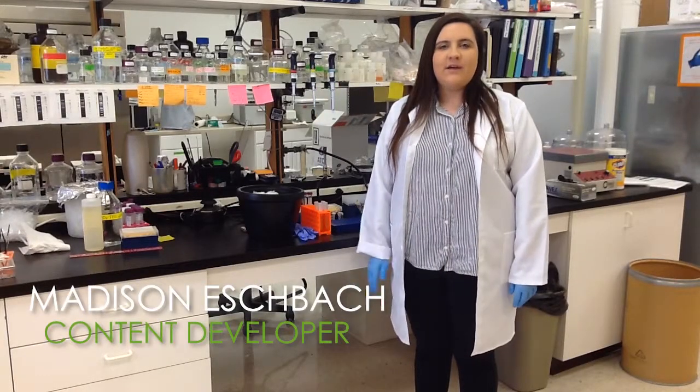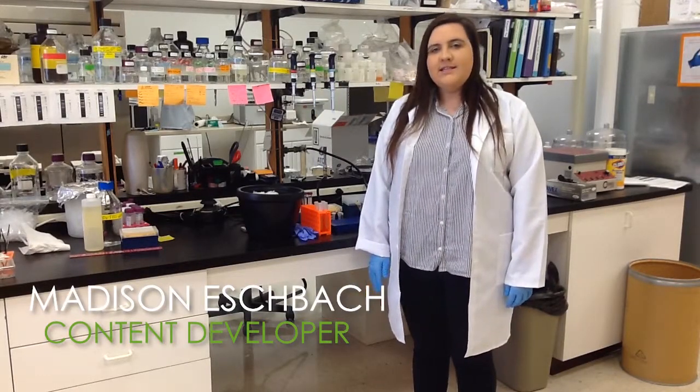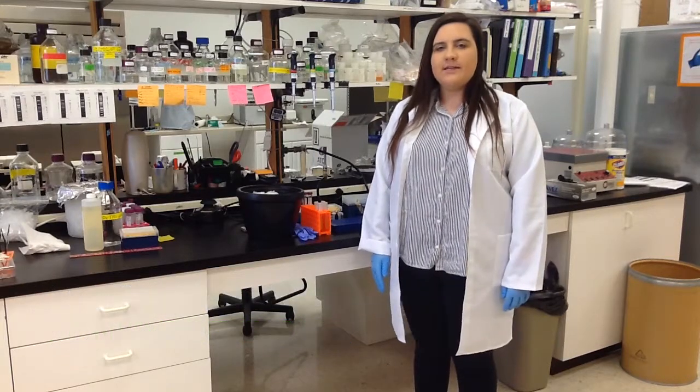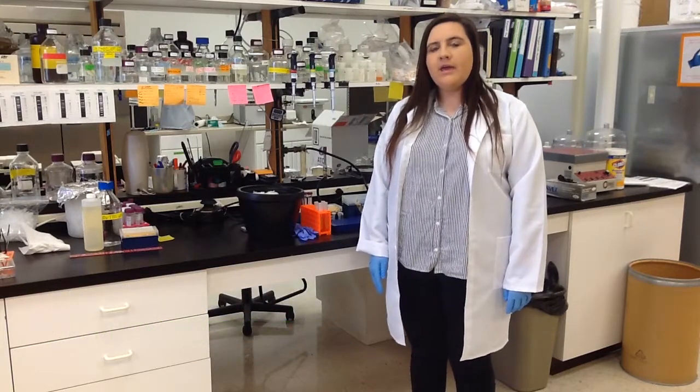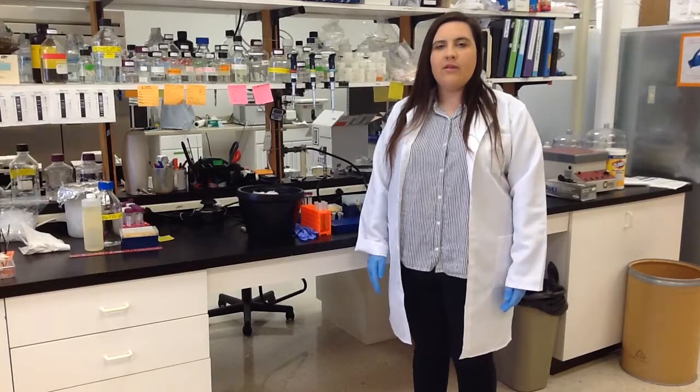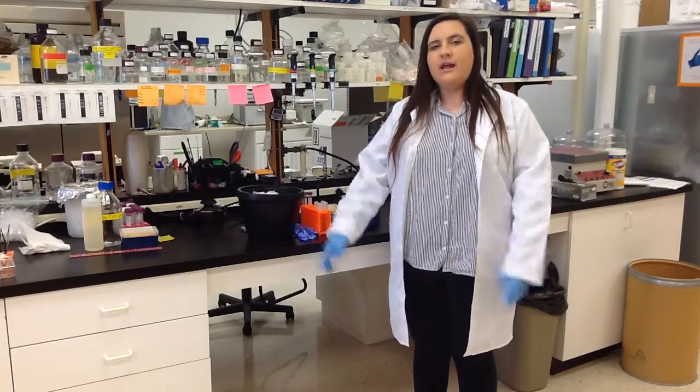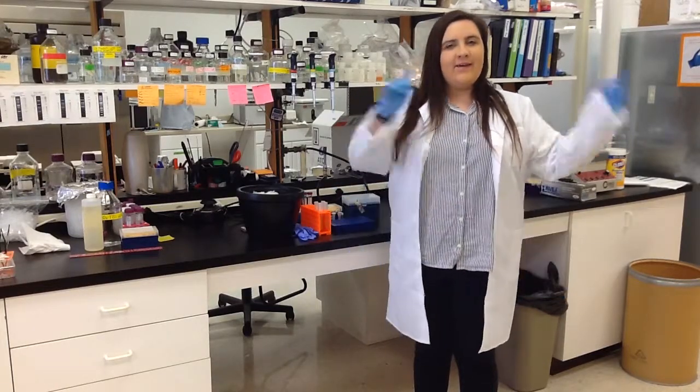Hi guys, it's Madison and I'm a content developer here at Gold Biotechnology. Today we're going to be going over how to use our bacterial cell lysis buffer and our protease inhibitors so you can see how they're useful in your protein extraction. If you guys want to check it out then let's go ahead and get started.